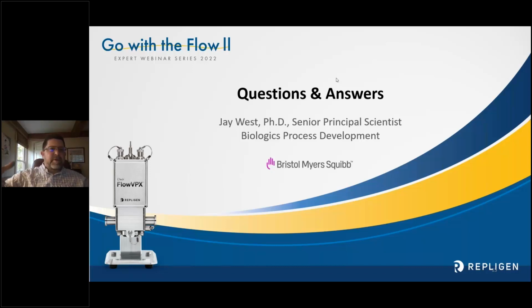However, when you think about it, you're concentrating 20 times, and the holdup volume can be up to several liters. They can calculate that, but it's hard to get a really exact calculation of holdup volume, so they have to factor that in along with the mass. So they get an approximate mass and an approximate concentration, and that actually is not that accurate. When they've done a few comparison studies, it can be up to 10 to 15% off.